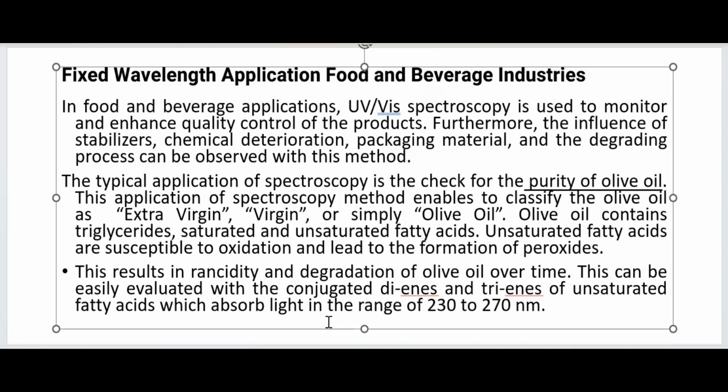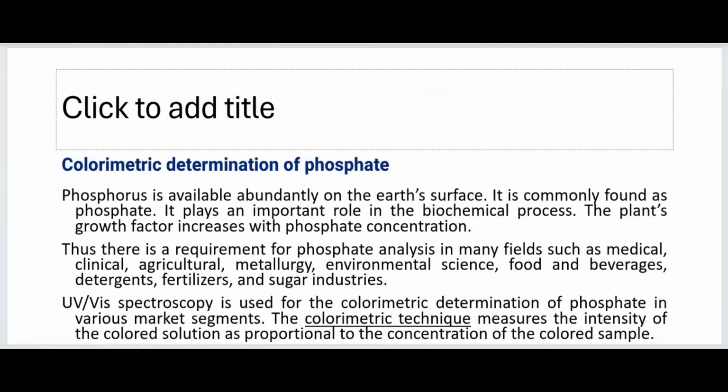There is oxidation, so addition of oxygen we are talking about, or reduction when you talk about addition of hydrogen. In terms of electrons also you can define it, but yes, there is a structural change. A single atom addition or removal, or functional group addition or removal, can also give you variation in lambda max values, and you can comment on the quality or purity, presence or absence of that analyte under study.